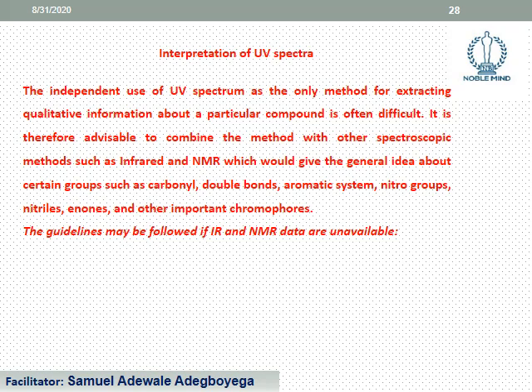Now, from previous studies you have been told that the independent use of a single spectroscopic method cannot give an accurate or confirmatory answer to what your structure is.